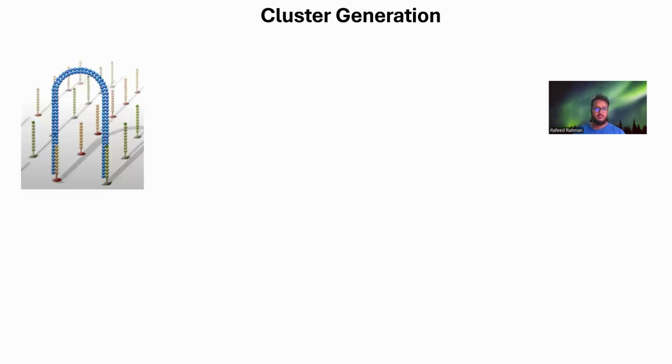So next part is cluster generation. The first question you may ask is why do we need to generate clusters? As I said before, you have these single strands for each fragment, sparse and in different places of the flow cell. It's very hard to monitor the synthesis process of these standalone single strands and to infer the sequence.